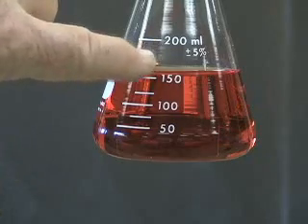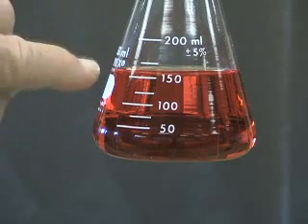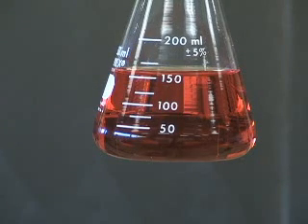The flask tells us that the readings marked on it are plus or minus 5%. So even if the liquid was right on the line, it would be an error by plus or minus 5% of 150 milliliters, or whatever volume you saw.